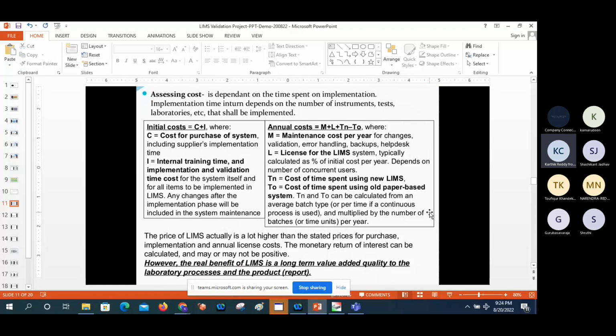organizations. Why? Because once LIMS is implemented, there is no ALCOA issue, there is no data integrity issue. So zero tolerance of all types of activity can be an outcome from the LIMS. We could not allow modification of any data from the system. If you have done anything, it would be auditable as part of 21 CFR Part 11.